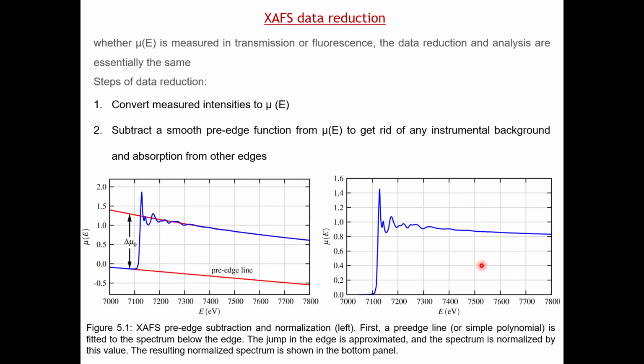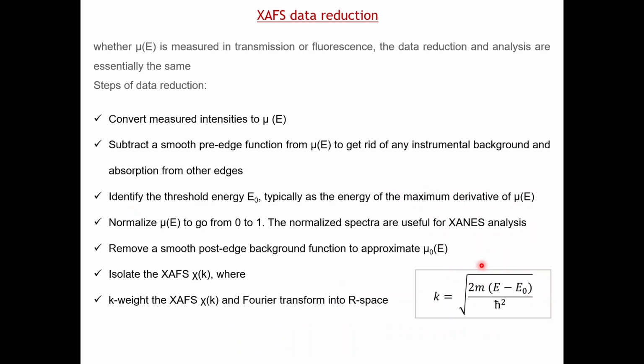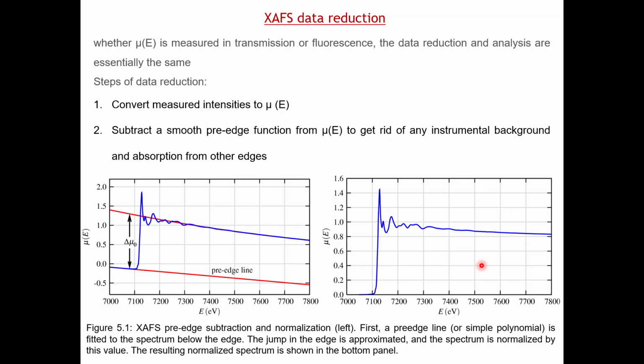And also one more thing: which data will be good depends on your sample, whether the sample is on a substrate or is a powder sample. It depends also on the sample preparation or the nature of the sample. So step by step I will cover this data processing.